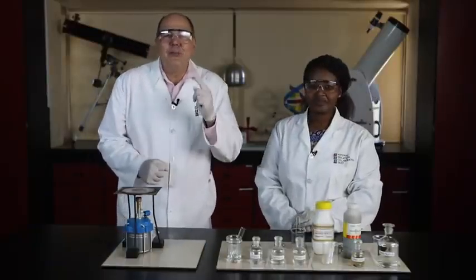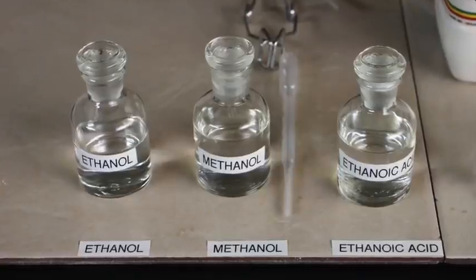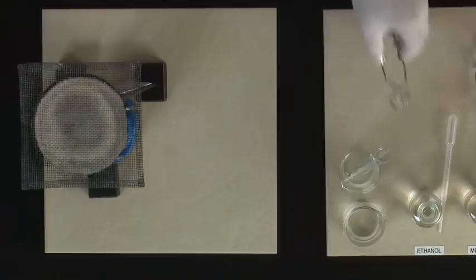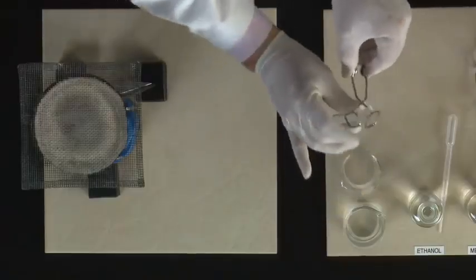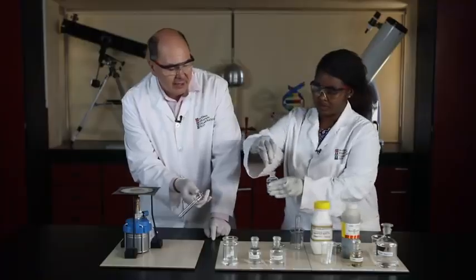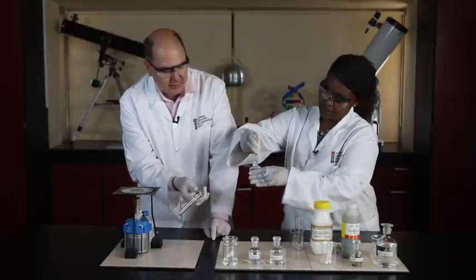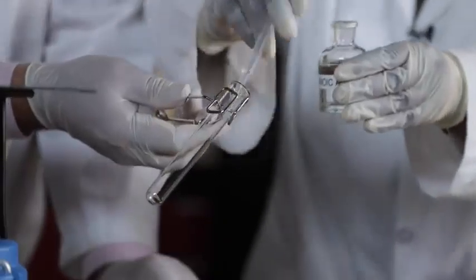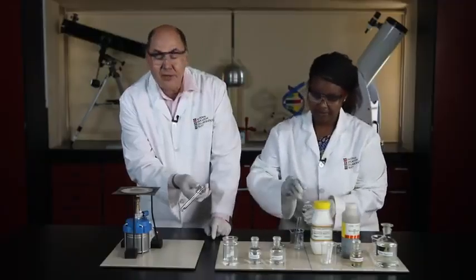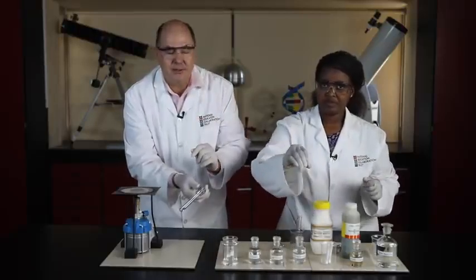Right, we are ready to make the first esters. We are using ethanoic acid reacting with ethanol in this first investigation. Right, let's get our test tube ready. And we're going to add 2 ml of ethanoic acid to this test tube, using the pipette. There we go, beautiful. Now, ethanoic acid smells just like vinegar. That's important to take note.